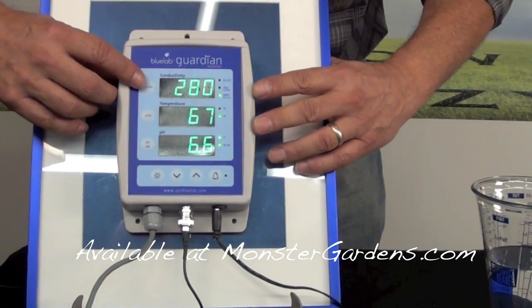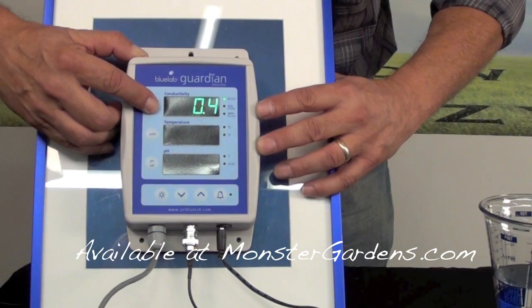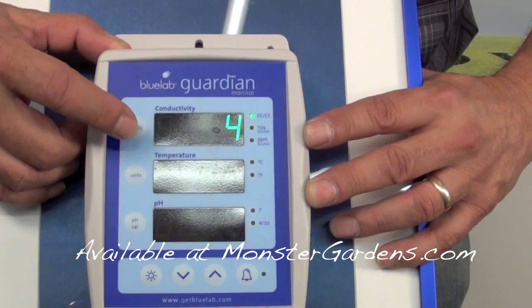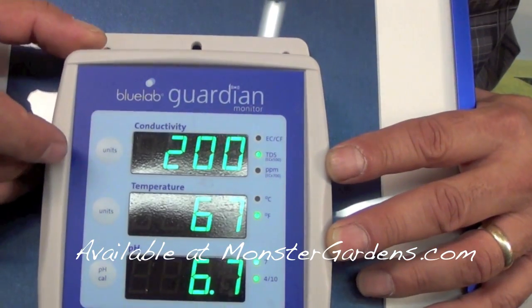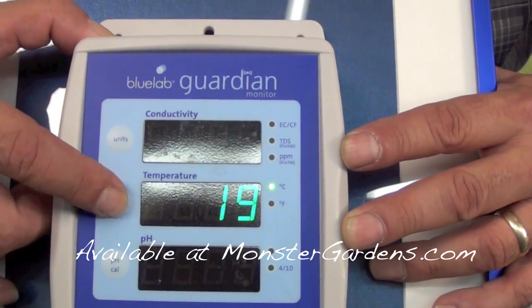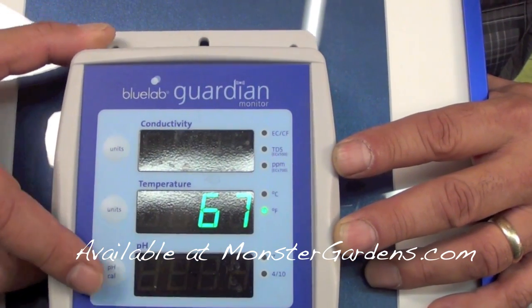If you wanted to change PPM 700 to EC, you just push the button until it moves up there — that's EC. Push the button again and it'll change to CF, for those in the UK. Push the button again and you can get TDS 500. And the same with temperature — if you don't want Fahrenheit, you can change it over to Centigrade. We like Fahrenheit anyway.